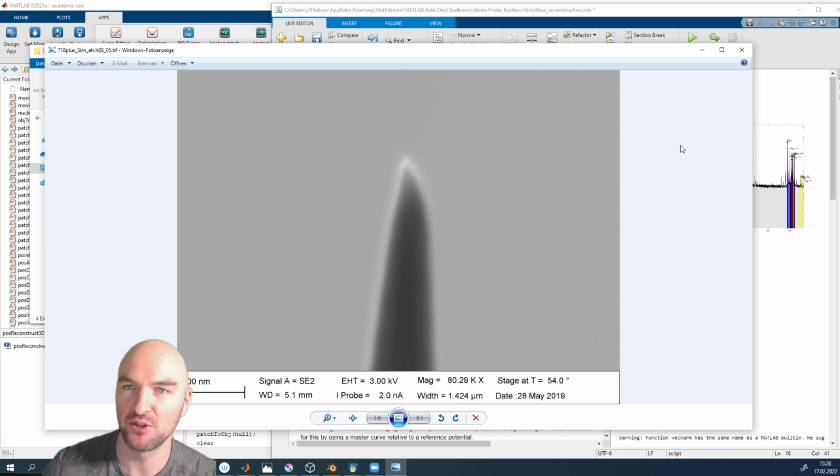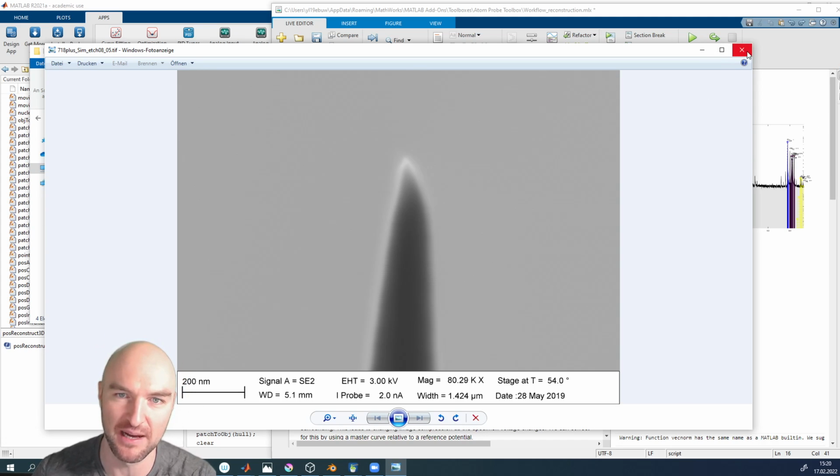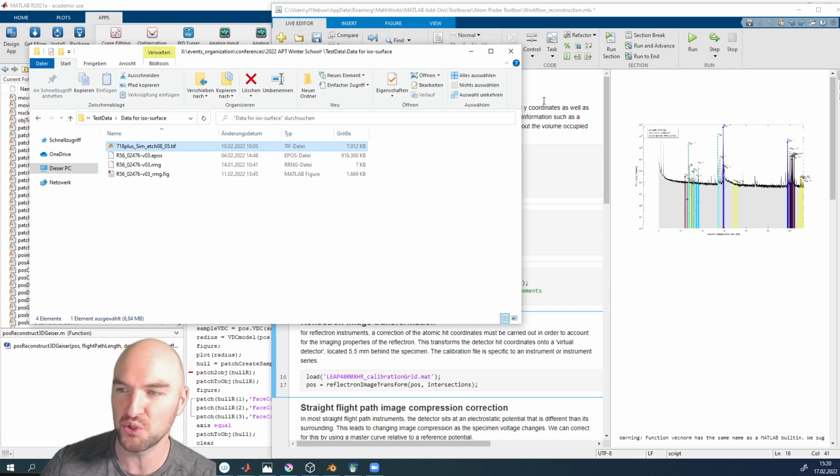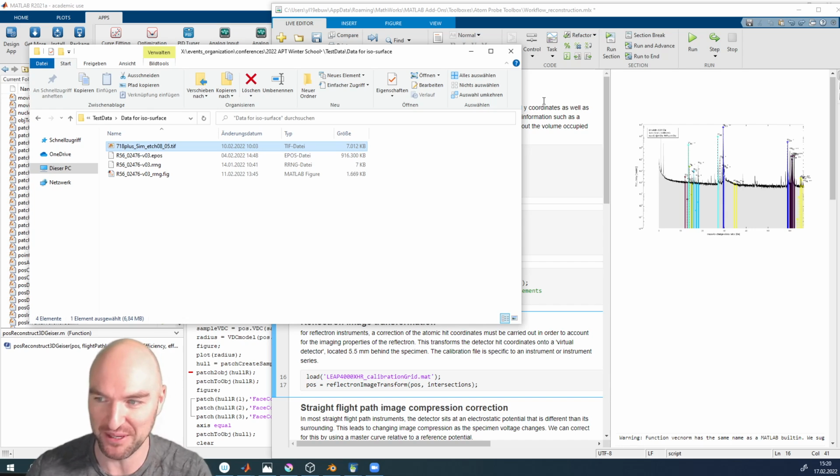So if you do that kind of work, always make sure that you have some rotation calibration between the sample in your transmission electron microscope, scanning electron microscope, whatever, and your atom probe. In this case, using just the copper crimp tubes is usually not all that great an idea, because you're definitely going to lose that orientation relationship. So you're going to have to use something else. One very easy thing you can do is just squish your copper tube so that you always know what direction you're looking at. But you have to really make sure that you know that.